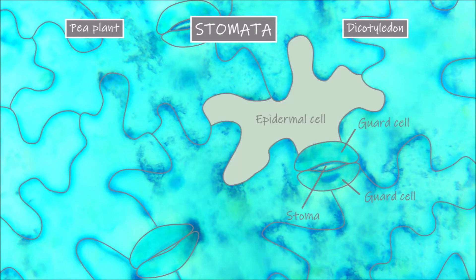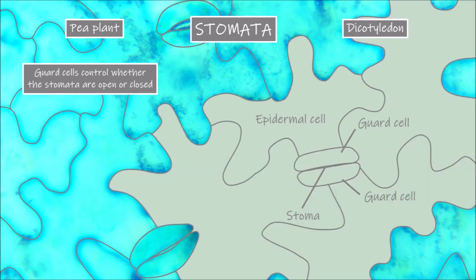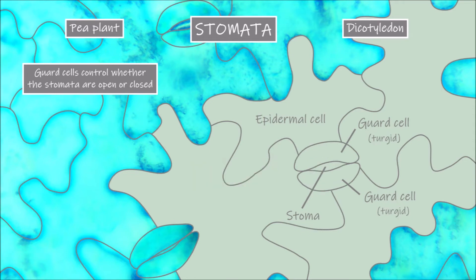These guard cells function in controlling whether the stomatal pores are open or closed. When the guard cells are flaccid, the stomatal pore is closed and CO2 cannot enter into the leaf. When the guard cells are turgid, the stomatal pore is open and allows CO2 to enter and diffuse into the cells to be used in the process of photosynthesis.